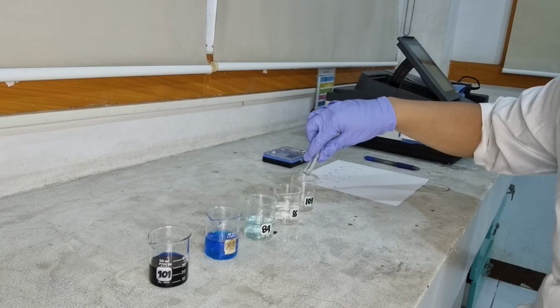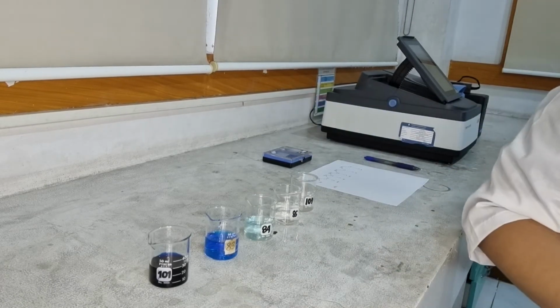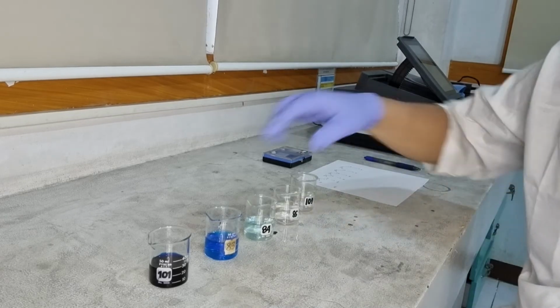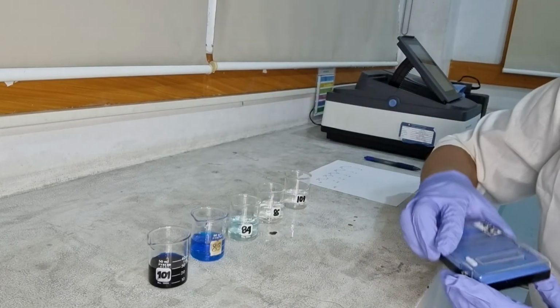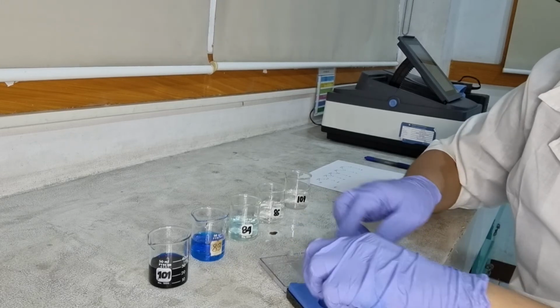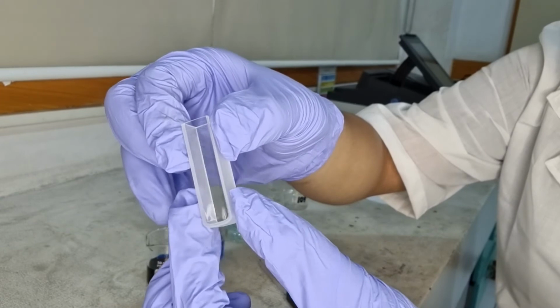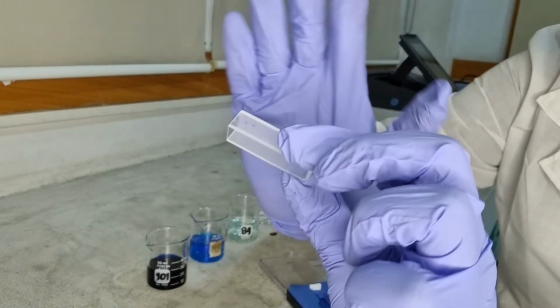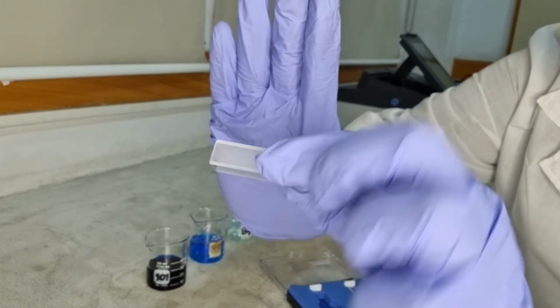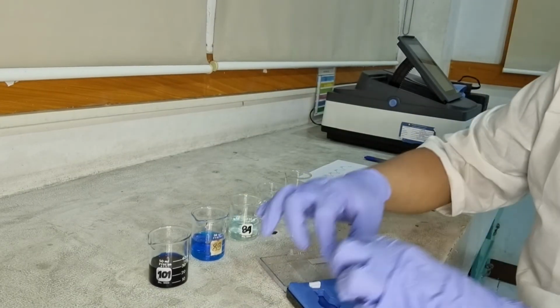After I prepare my multiple dilutions, I'm going to transfer to read the solutions in the spectrometer using a cuvette. Cuvettes are made with special glass to prevent drastic absorption of UV visible light, and they have a defined path length. The sides of this cuvette are frosted, and I could only hold it here so I would not damage or dirty the front and back of the glass where the light will pass through.